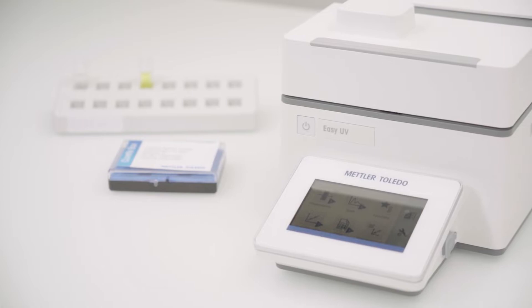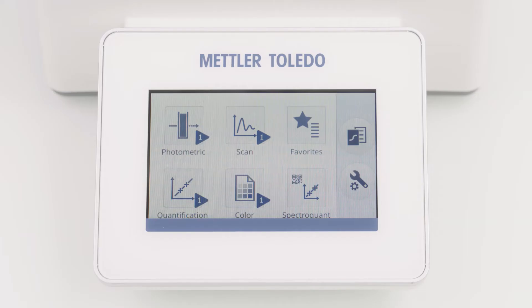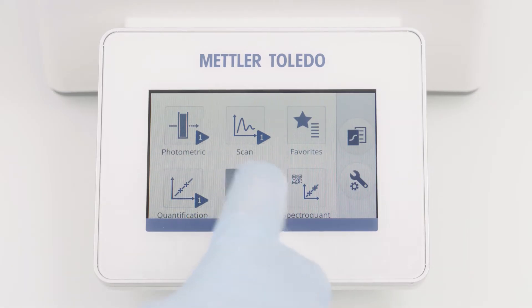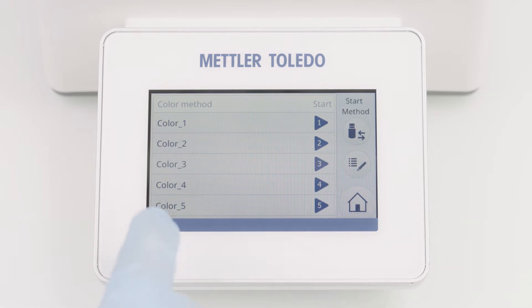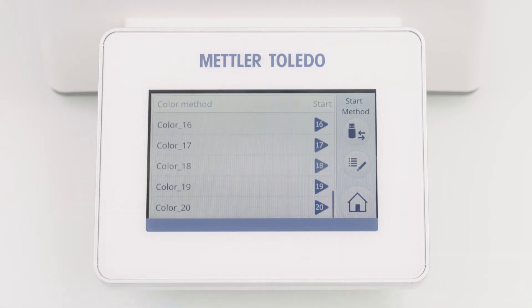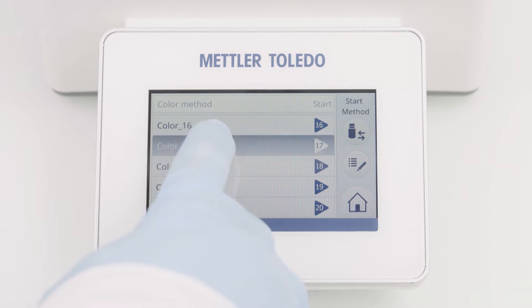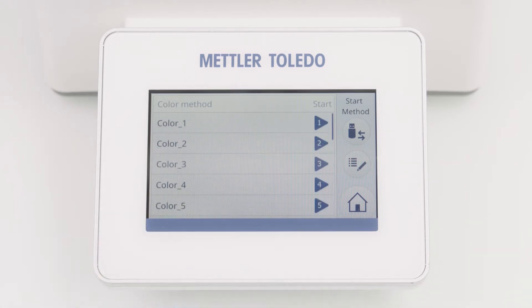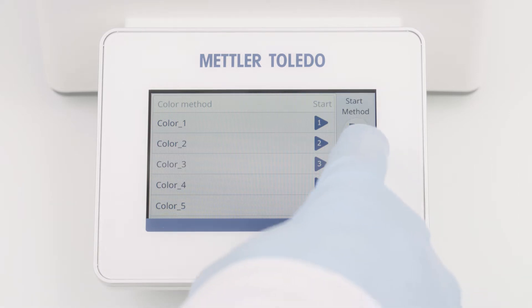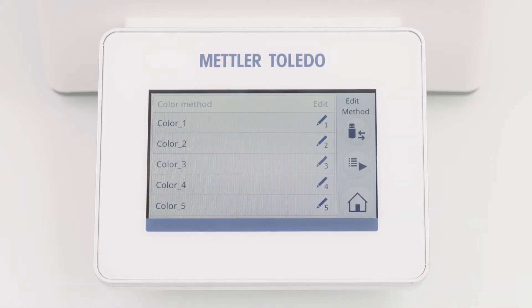Let's start with the configuration. Click the color on the home screen. This opens a list of 20 predefined color methods. Each method can be adjusted individually and exported to a USB flash drive. To enter the method editor, just click on the edit button and select your method.